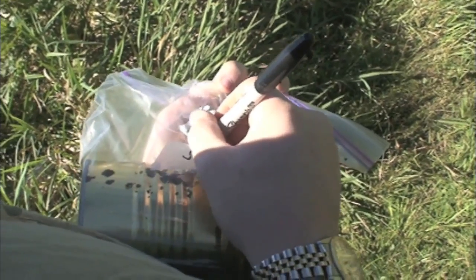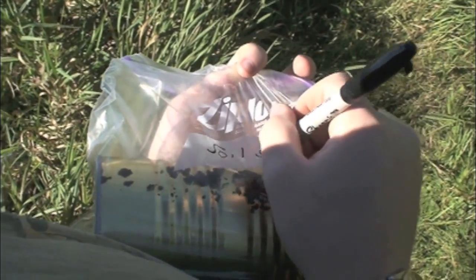Make sure to seal your bag tightly and label the bag with the location you took the sample from.